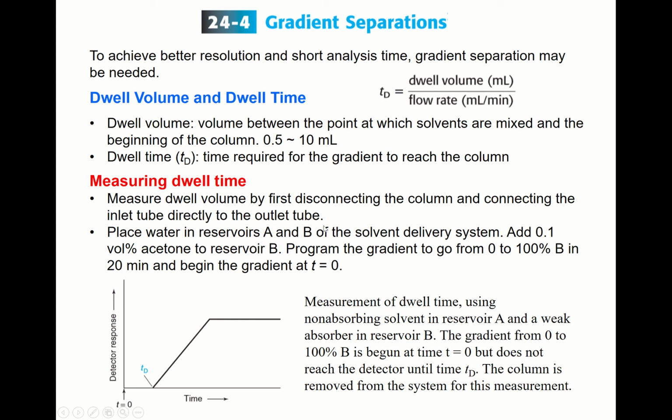That means the water percentage will slowly decrease in proportion to this acetone solution. Make it for example 20 minutes, and then you start the HPLC.